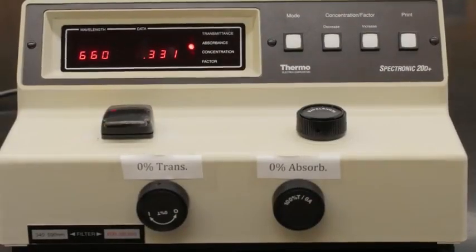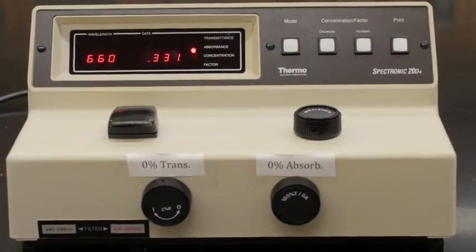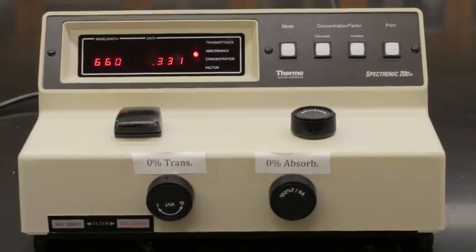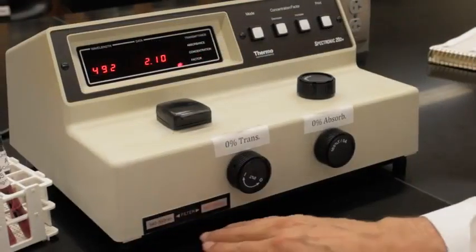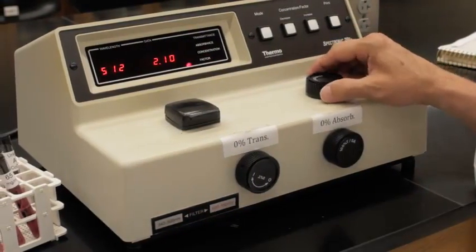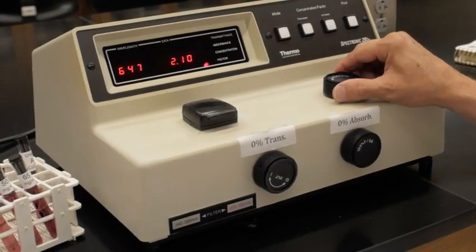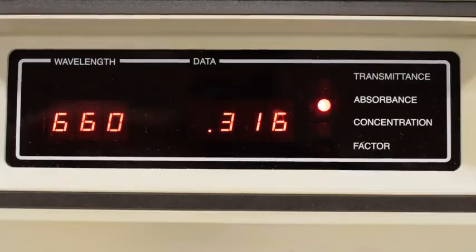A spectrophotometer measures the absorbance of each of our standard dilutions and provides data for our standard curve. Be sure to watch the video How to Use a Spectrophotometer on this website. Before measuring our standards, we need to set the spectrophotometer on the wavelength that cobalt chloride solution absorbs the best, which for our work today will be 660 nanometers. From previous work with cobalt chloride, we know that the peak absorbance is at 660 nanometers.